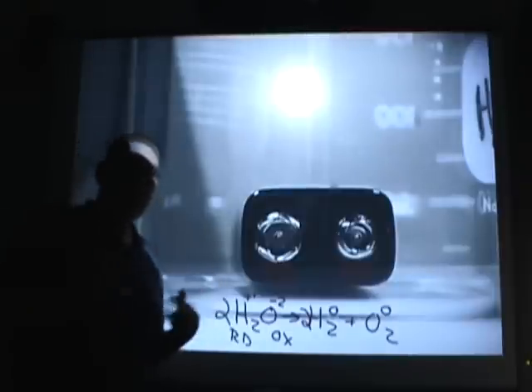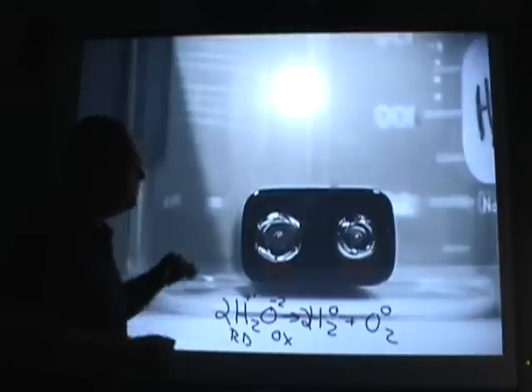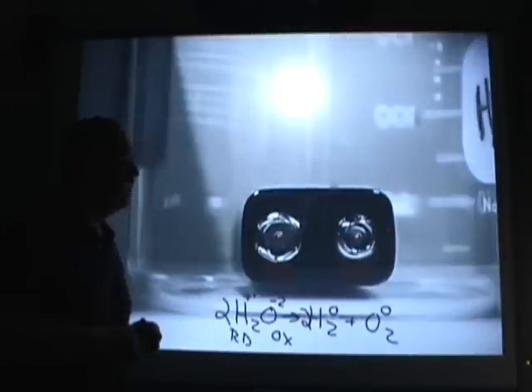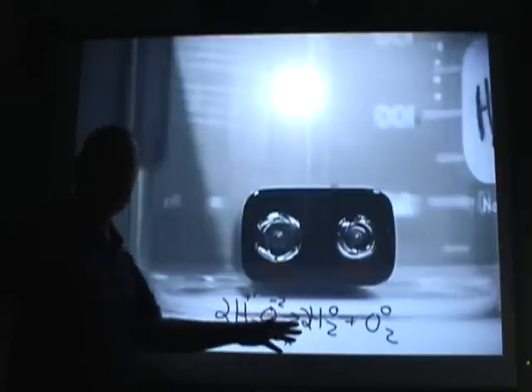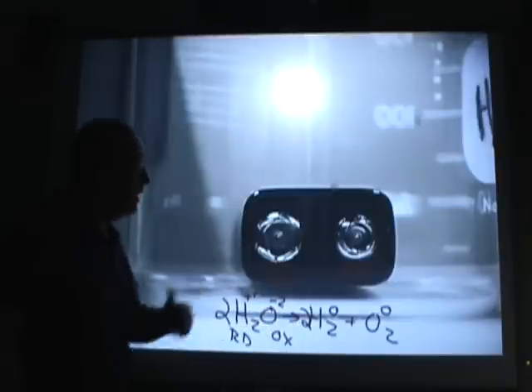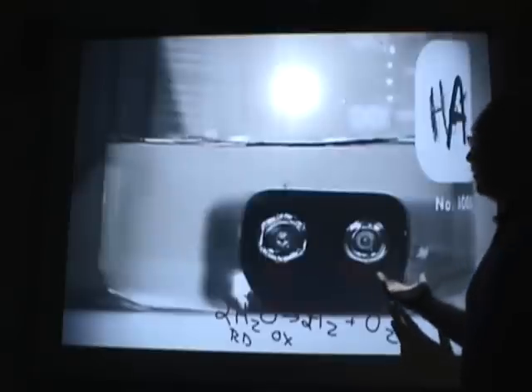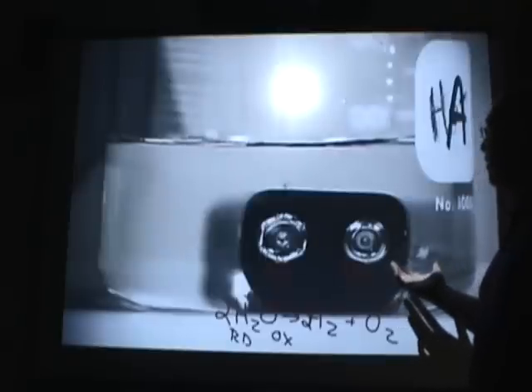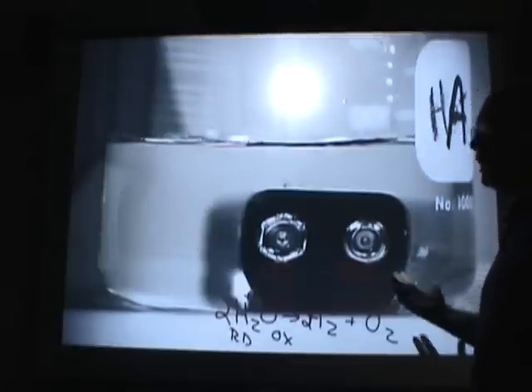Let's see if this battery can put out enough juice to split this water up into hydrogen and oxygen. Now, they're both gases, so the outcome should be fairly predictable. We now have water in this beaker, and you'll notice that there's absolutely nothing going on. We would expect, if this was decomposing, that we'd get some hydrogen and oxygen gas bubbles coming off of the terminals.